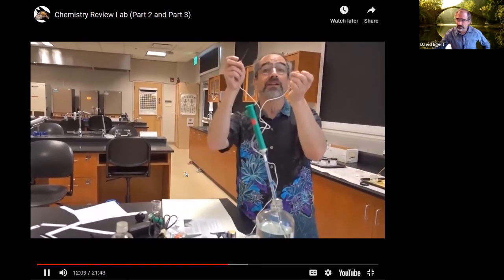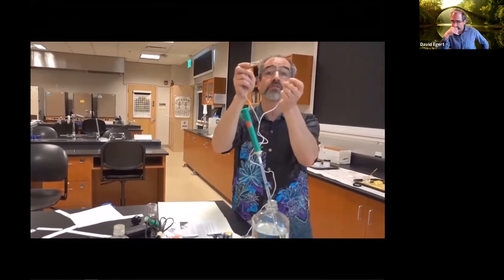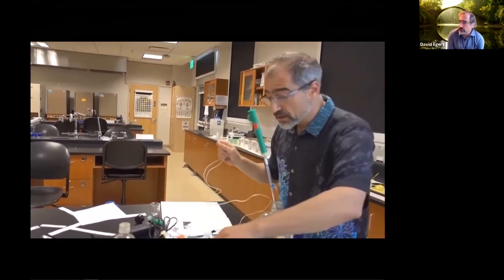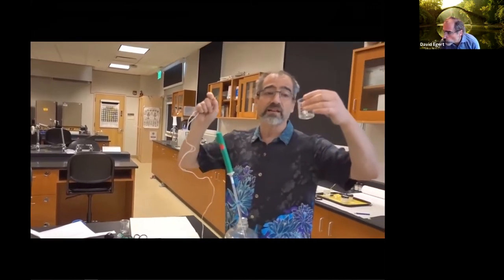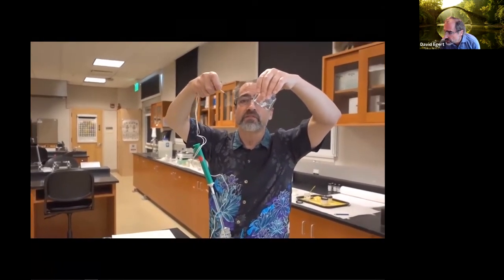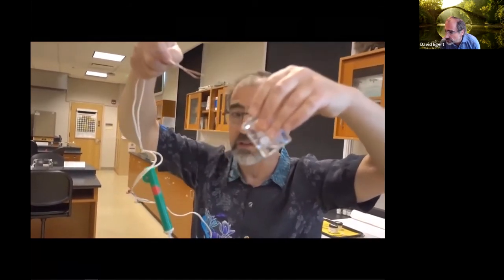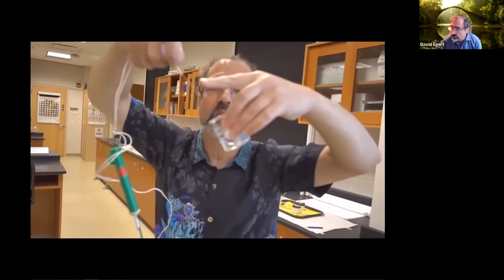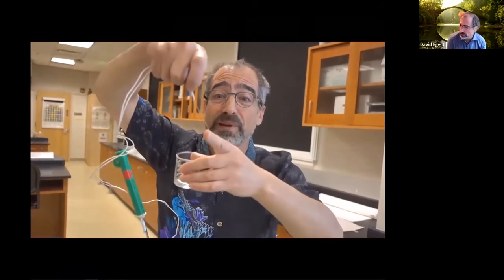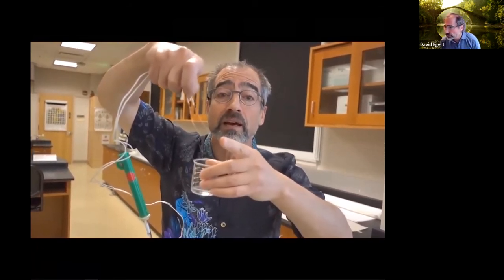The air right now is not conducting electricity very well because I don't hear a buzzer. There's no electric current flowing through the air from wire to wire when they're separated. I can take one of these solutions and, again, these wires are not touching, but if I put the solution in so both wires are submerged by the solution, I can see if I hear the buzzer going. And when you do this, you want to make sure that the wires have a lot of surface area in contact with the solution. If you just barely dip their noses down, there's so little contact, you're not really going to get a good answer.